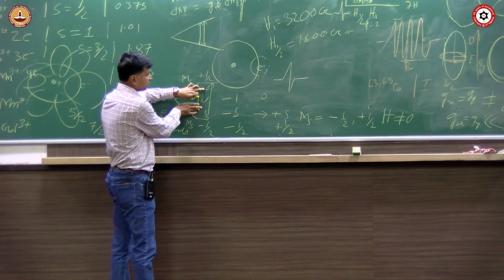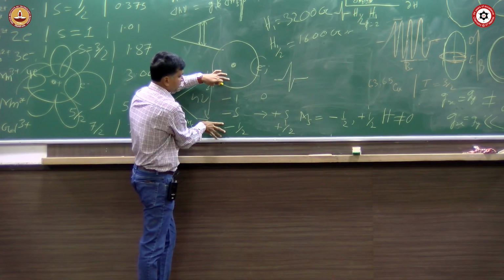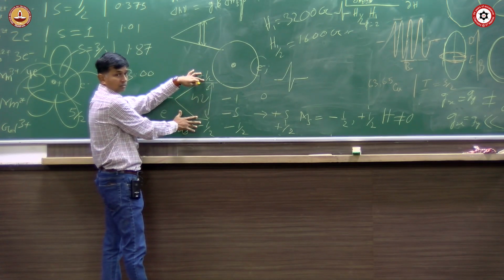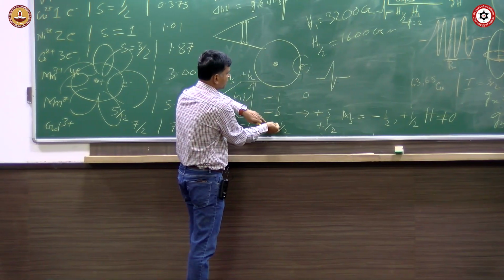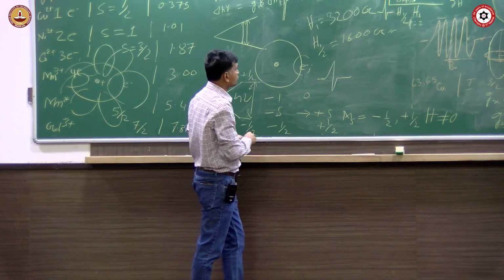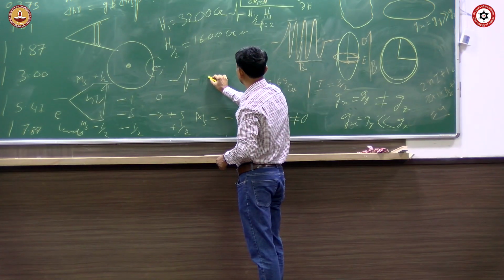So this is the electronic energy levels, then they will further couple and produce more energy levels here, and then they will undergo transitions between them. This initial splitting is no longer valid; this is the final splitting. So I will get the signals because of this. So for the copper, I will not get a single signal, I get a signal maybe like this.